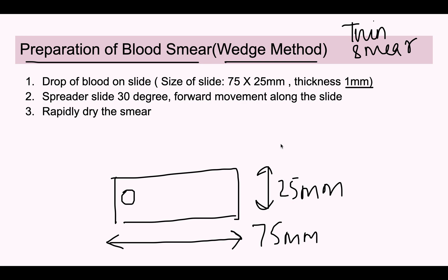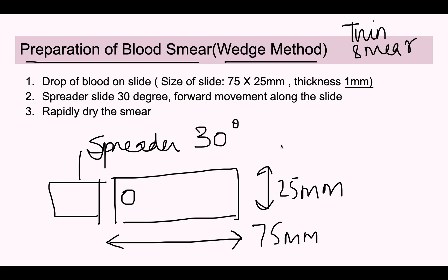We then take another slide known as the spreader slide. This spreader slide is held at a 30-degree angle, touches the drop of blood, and a forward movement is used along the slide to smear and spread the drop of blood. The slide should then be rapidly dried with the help of an electric fan. This completes the preparation of the unstained smear.